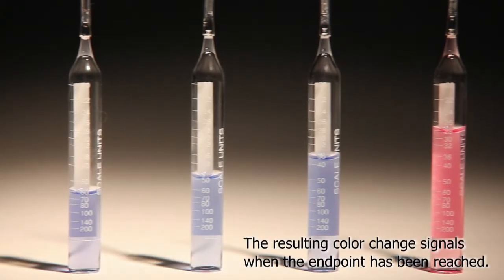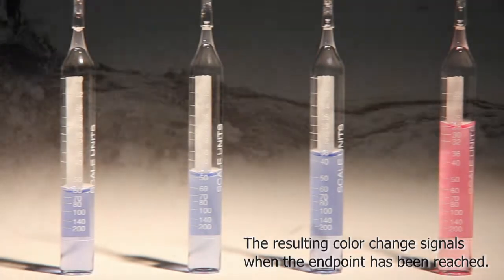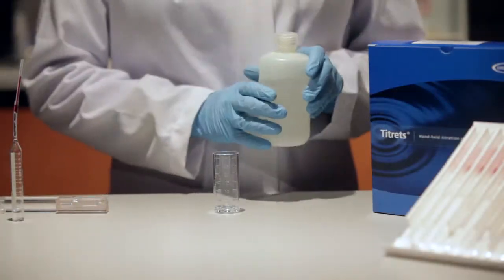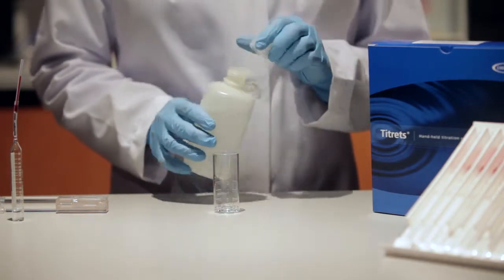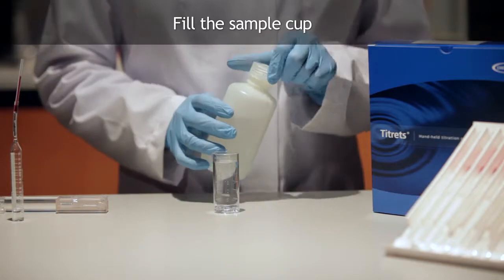The resulting color change signals when the endpoint has been reached. For purposes of this video, we will be illustrating the total hardness test procedure. To perform a total hardness test using the Titretes method, fill the sample cup to the 25-milliliter mark with the sample to be tested.